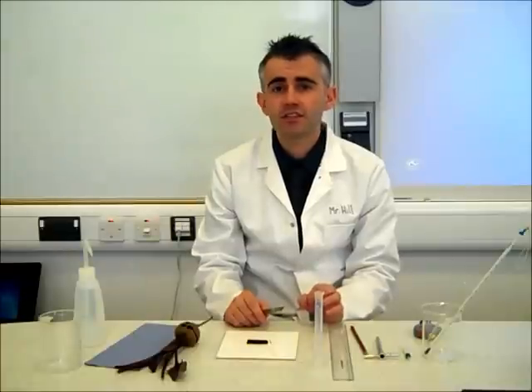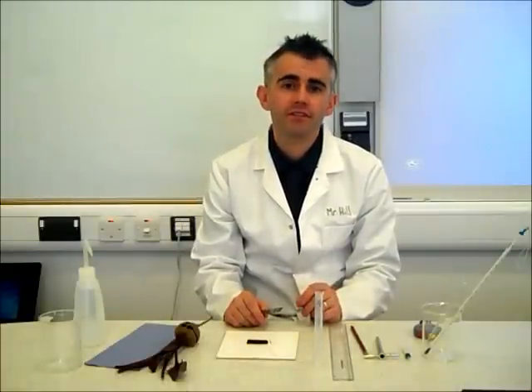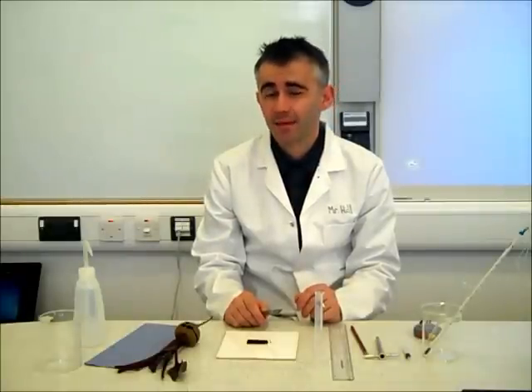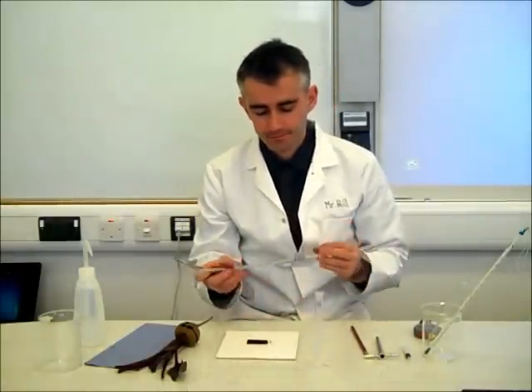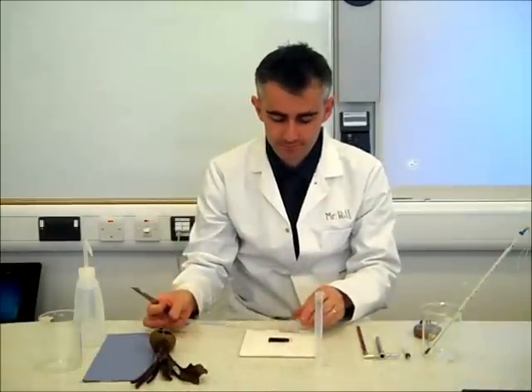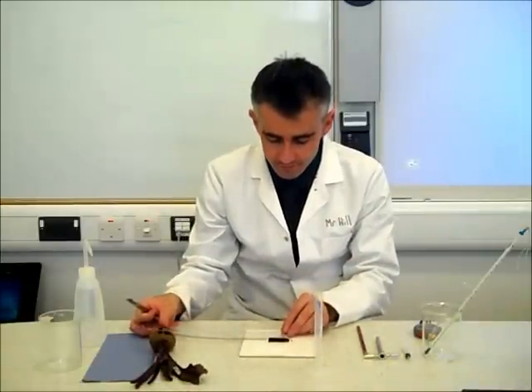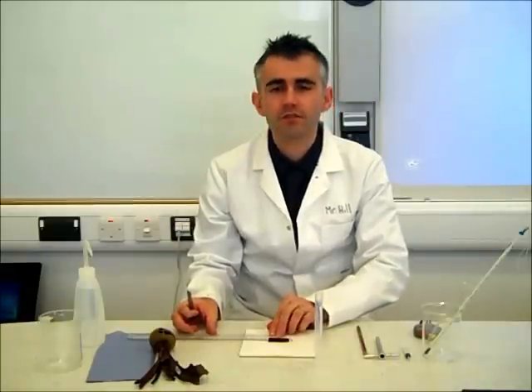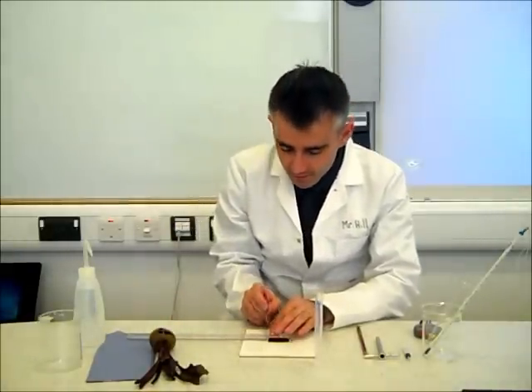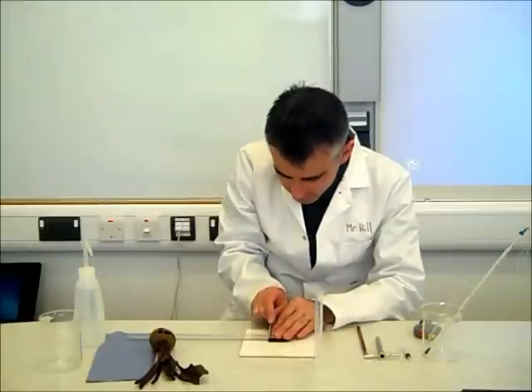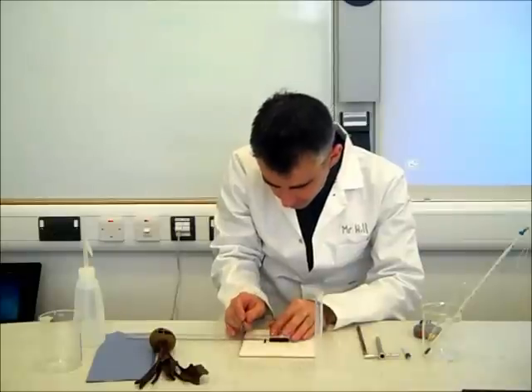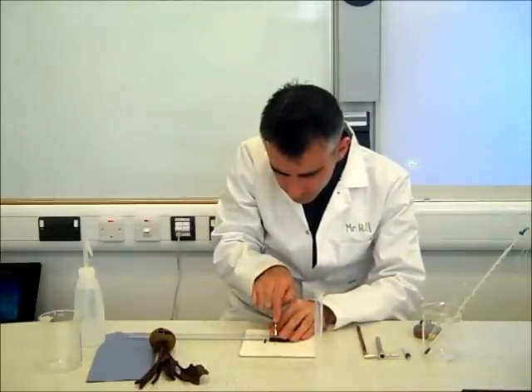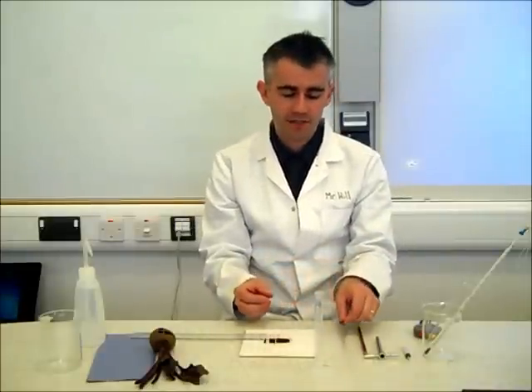When doing this investigation, you will want a minimum of five different temperatures across a range — ideally eight temperatures. We're going to use six. Using a ruler, I'm going to cut a section of the beetroot which is one centimetre in length. Be very careful when using a scalpel as it is very sharp.